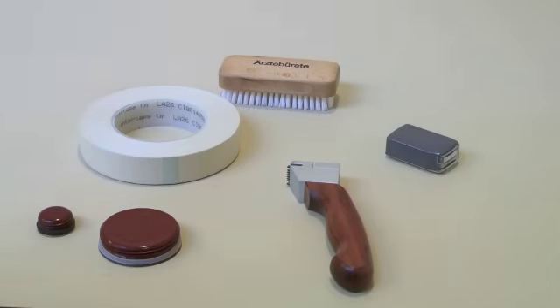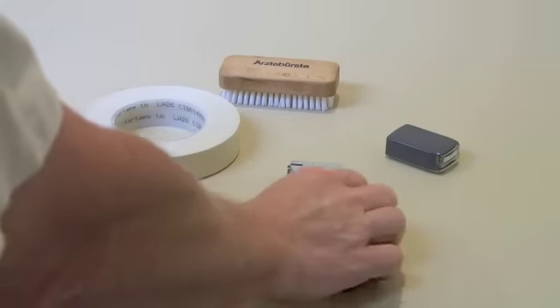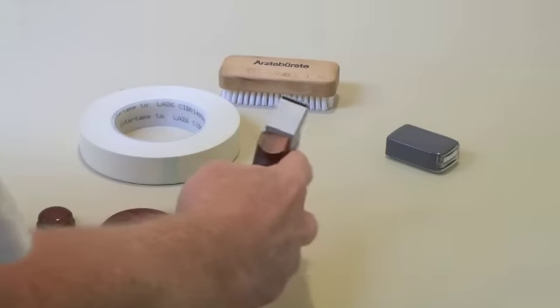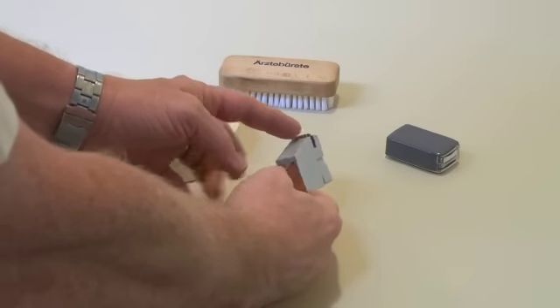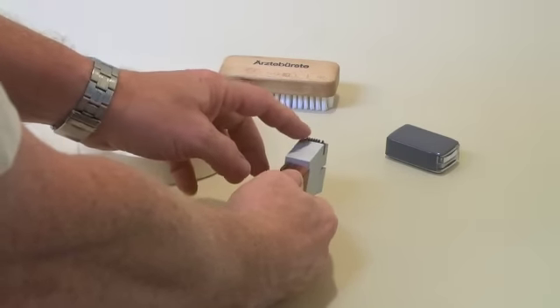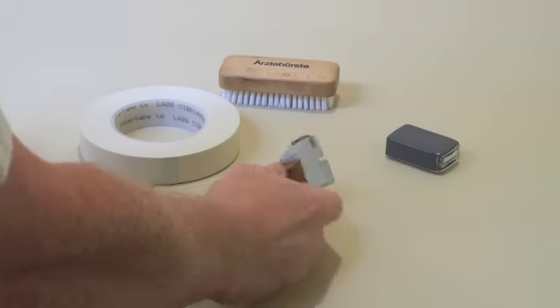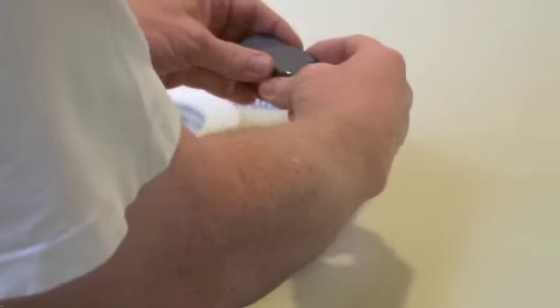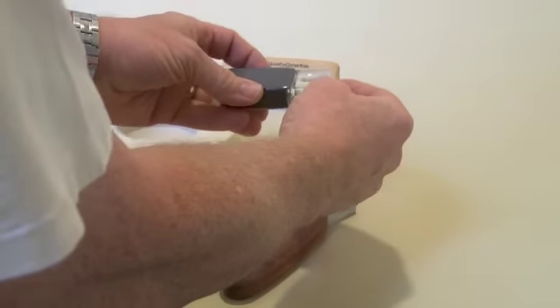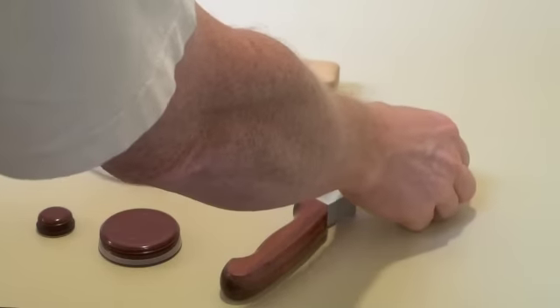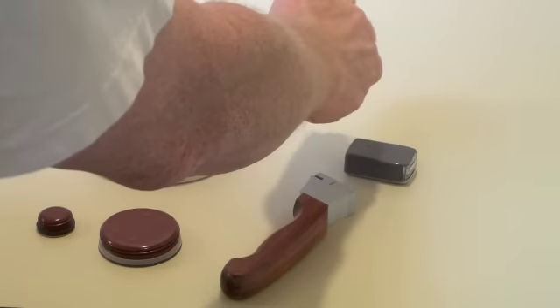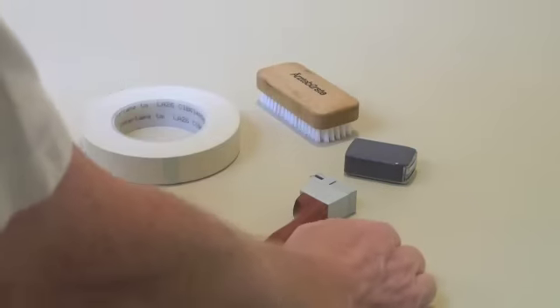Your BYK-Gardner crosscut testing kit consists of a crosscut test handle with a special blade. In this case we are using a 1mm spacing 6 cut blade, a set of magnifiers that help us check out the cut after we have completed it, and a brush to brush off the cut area.